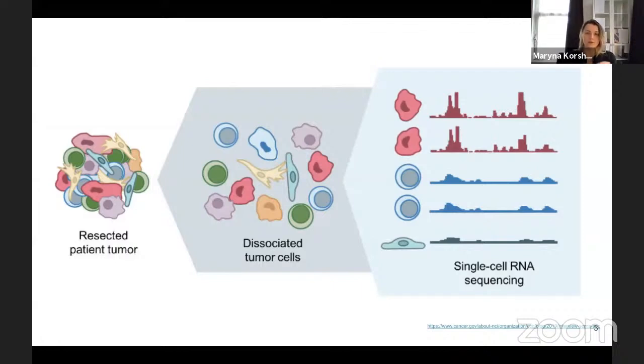In particular, if you would like to analyze one bulk sample, which was already analyzed on the single cell level by another experiment, or you already have this data set, you can match and see which kind of cell proportion with a similar expression of marker gene cell profiles could be in this bulk data.